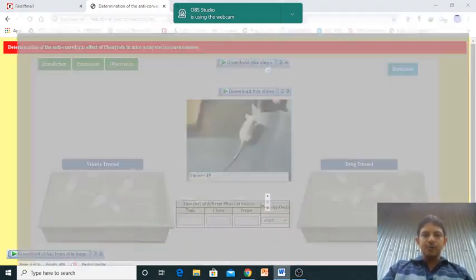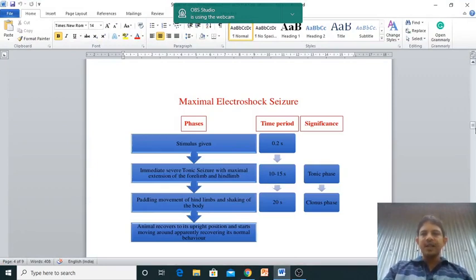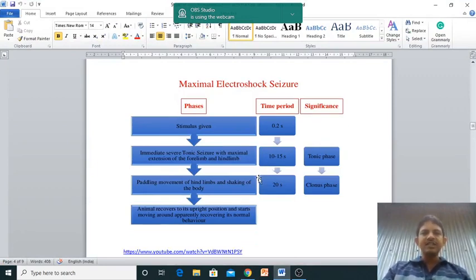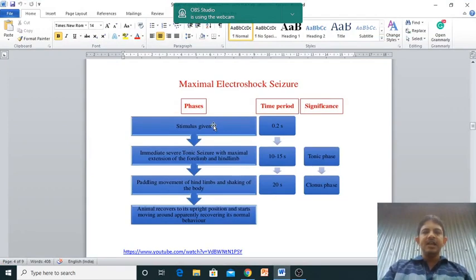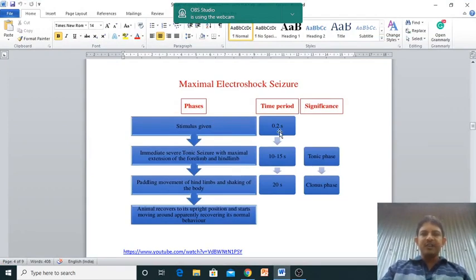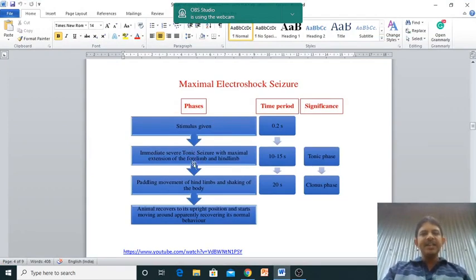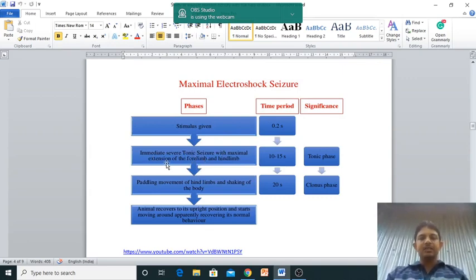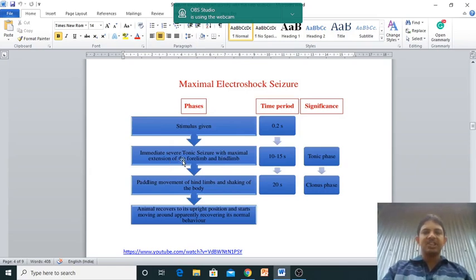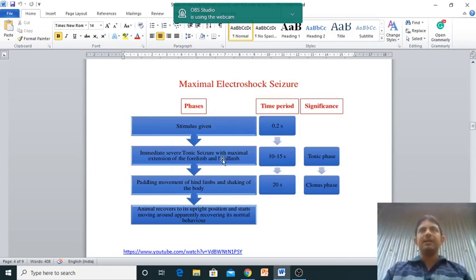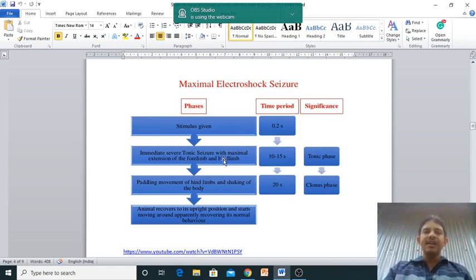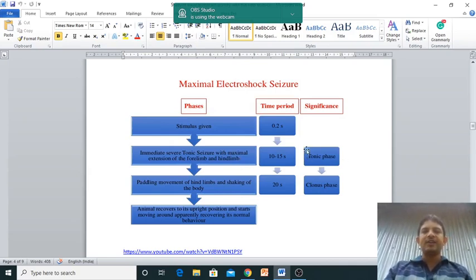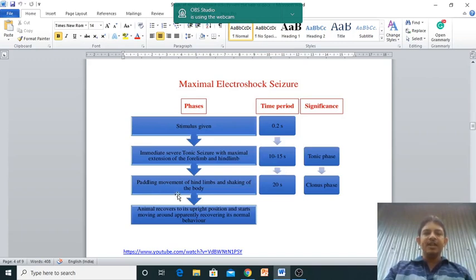Now I'll show you - whenever we are giving the electric shock, generally stimulus is given for 0.2 seconds. Then immediately severe tonic seizure with maximal extension of the forelimb and the hindlimb. So forelimb and hindlimb extension is there - that is known as the tonic phase. Generally it may be 10 to 15 seconds.